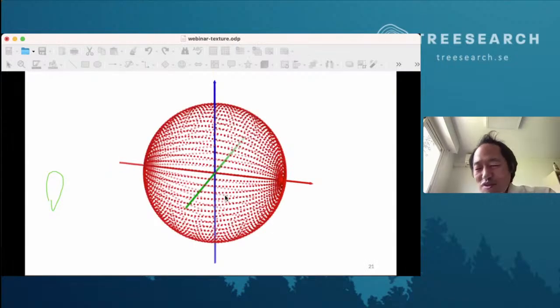Now, you rotate it on another axis. You have the fiber which is lying on a plane, and this fiber itself is orienting randomly along the axis. And then you have this kind of situation where you had a point, and then you rotate this point on the axis perpendicular to this. And this is a typical case of planar orientation, where in most cases with cellulose fibers, you have the fiber chain axis randomly oriented in the plane, but restrained in the plane.